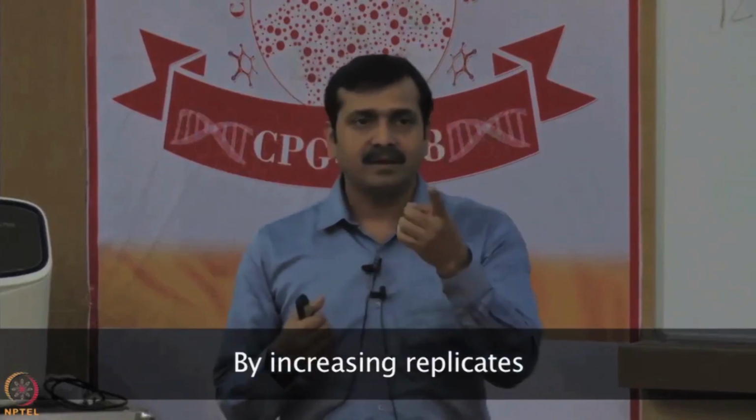Replication. Okay. So, two different experiments, you look for the same peptide being identified. So, you force me to go to the biologist and ask them to do a replicate study. Of course, that is a good idea always, but we can always increase our search engines. We can use different search engines and take their results and hope that multiple search engines will not simultaneously fail in giving you a wrong result.